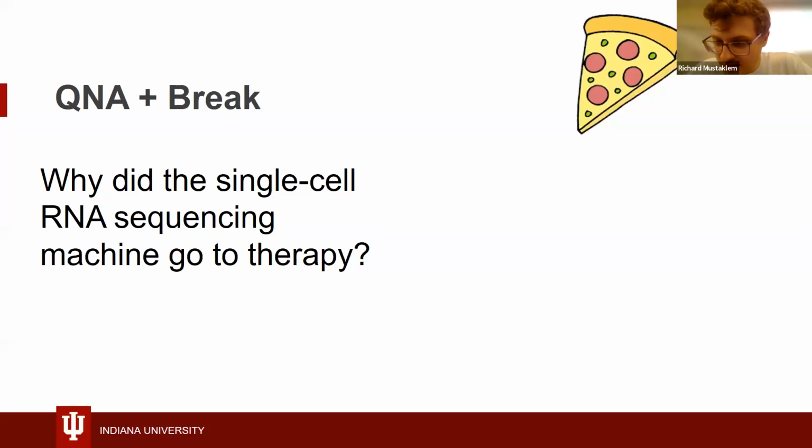Data set integration first of the samples, or integrate after? Now you're getting to a really good question, because integration is very controversial within single cell. There are some people who integrate at the very start, and some people who do quality control and then integrate. It would be incorrect of me to tell you there's one way to do it, because at this point there is no correct way. There are two sides to the coin.